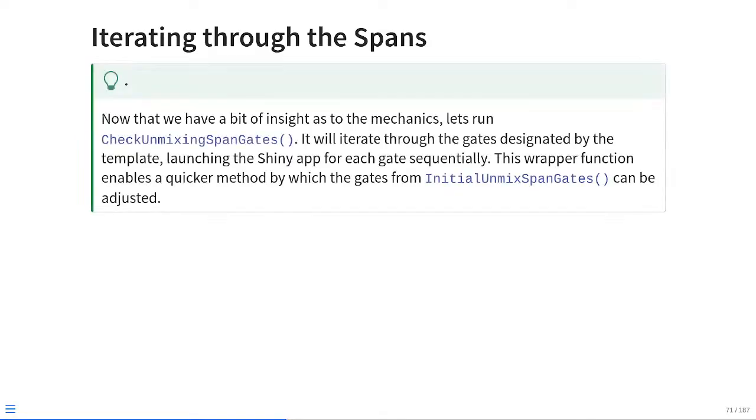All right, so let's put this in context. So far, we have our initial gating set. We used a couple of the new functions from Luciernaga just to make sure we actually created a template that could then be used to designate out the creation of all those new individual gates based off of the matching single color control with its peak detector when they're being created. And now what we really just need to do is something very similar to what we'd have for the commercial software, where we iterate through all these new gates as they are placed on the correct specimen, just to make sure when we're drawing a positive gate, it is placed correctly.